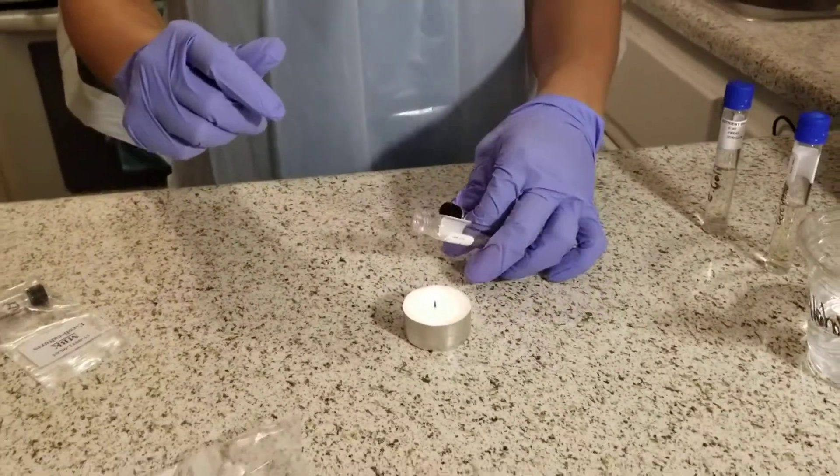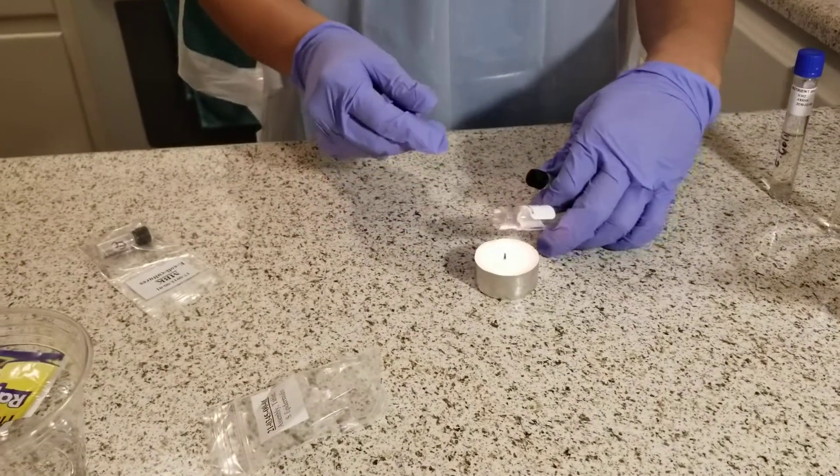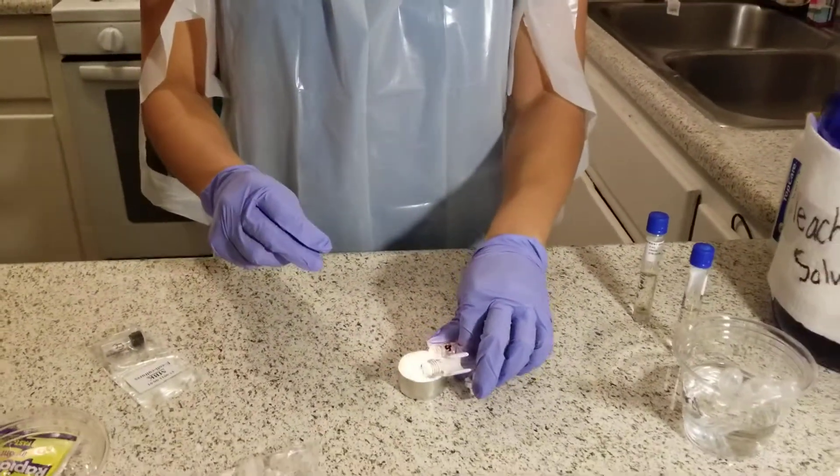You don't want anything to contaminate it. I'm going to put it over the flame so that it sterilizes the tip of the tube, and also the culture vial that I have.